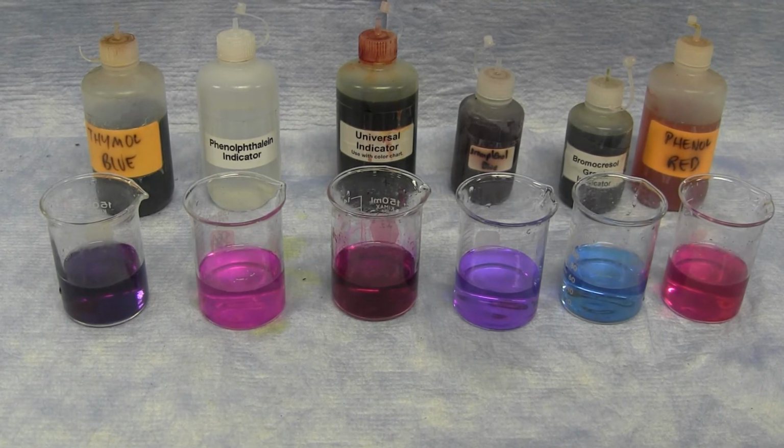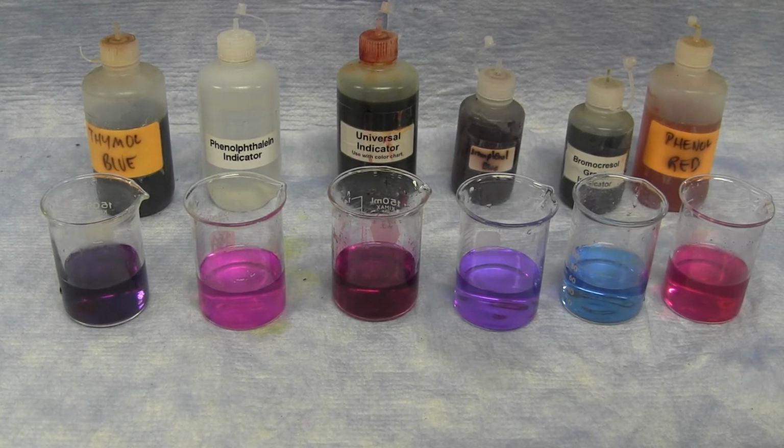All of these indicators had the same starting conditions, but changed their color as the sodium hydroxide was added. The pH of all of them is still approximately the same because approximately the same amount of sodium hydroxide was added.